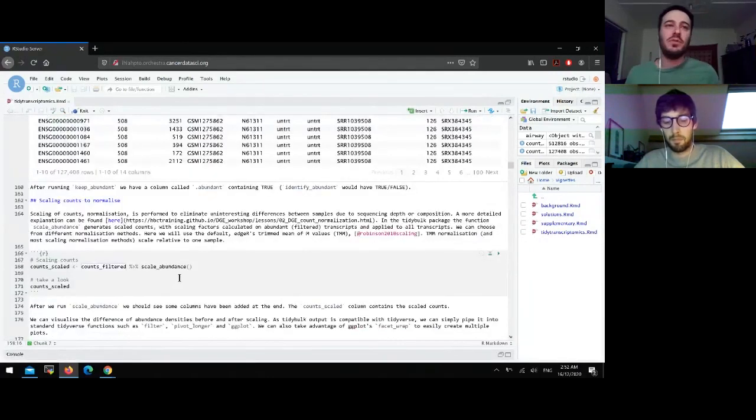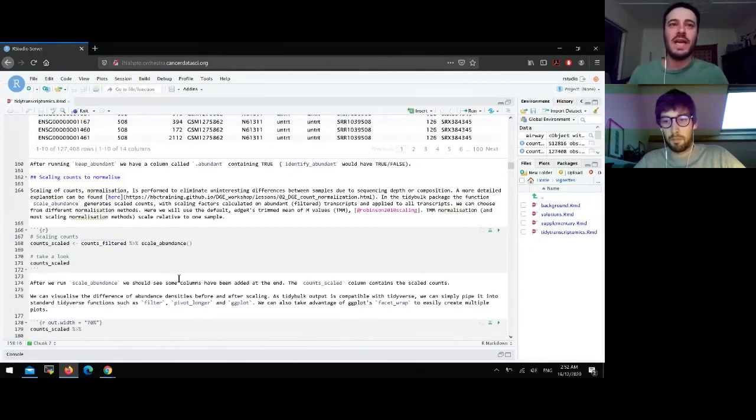Another important step of bulk analysis is scaling the data. It is also called, with the jargon, normalization. We need this because we are carrying technical variability from differential sequencing depth of different samples, and so we want to make all the counts consistent for visualization purposes. Also when we do hypothesis tests, this scaling will be done implicitly in the statistical model.